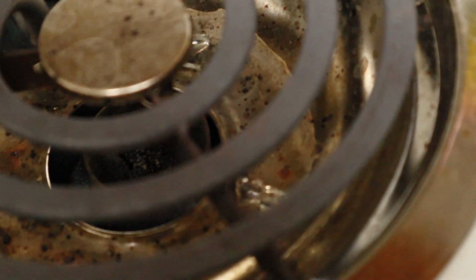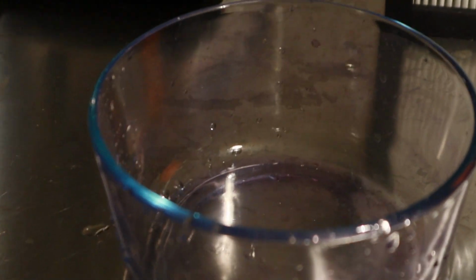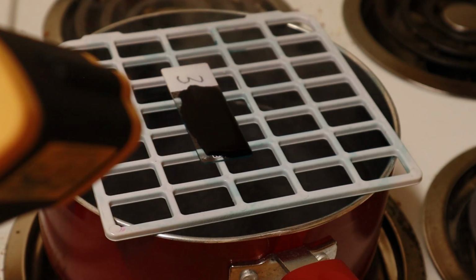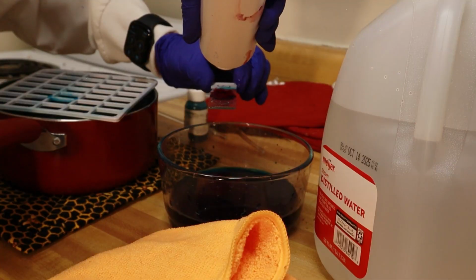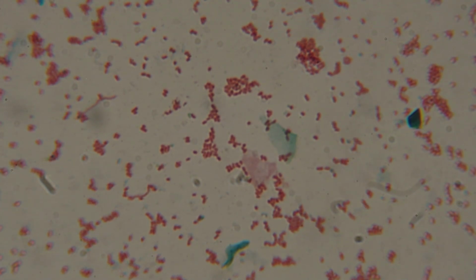But right when I started getting 60 to 70 C, the dish shattered from the heat. I got it from a garage sale before I knew the types of Pyrex, and I was like, ooh, Pyrex! So as I ordered an actual borosilicate one online, I just used a pot. Now at my stove, finally reaching 60 to 70 degrees Celsius, I started the 15-minute timer, and after it was finished, I dried it off. I put it under the immersion lens to see no green, no endospores. There was still one way I had written down to test if they were spores, and that's spore stalks.